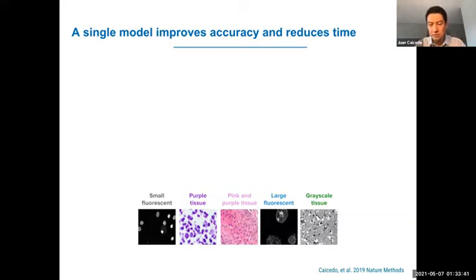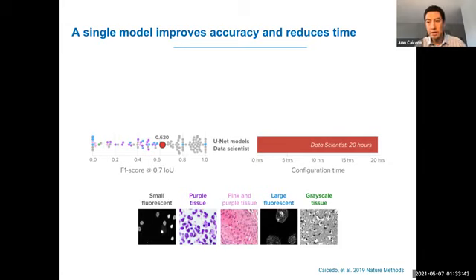So what are the options? One of the options is we can hire a data scientist that can take a basic U-Net model and train it with the training sets that we have, and then run one U-Net for each different type separately, because that was the practice at the time. Everybody was optimizing their algorithms for specific types of images.